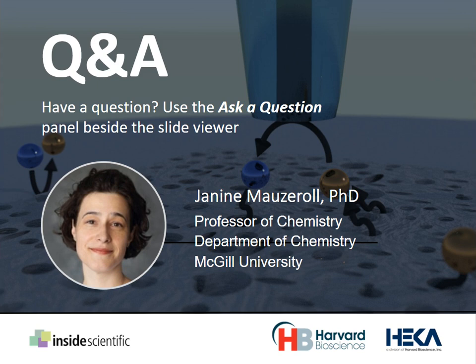I'd say that the SVET probes are less developed than SECM probes at the moment. They tend to be much bigger. The entire tip is usually around 100 micron. So that means your lateral resolution won't be that good. So I would say maybe you can't do the inclusion, but if your objective was, for example, to measure galvanic corrosion between two dissimilar metals, SVET could be quite good.